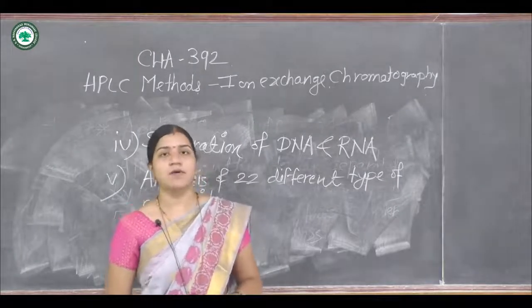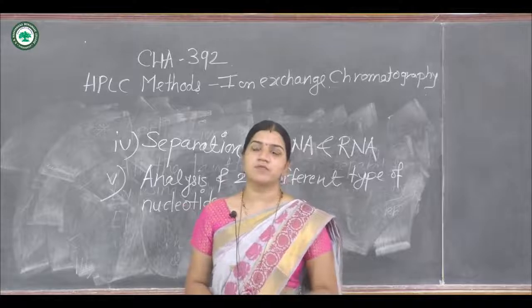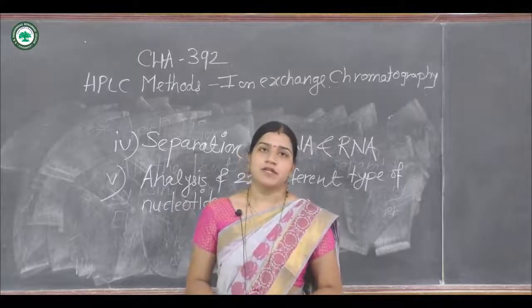So this is all about the ion exchange chromatography topic from the HPLC methods.